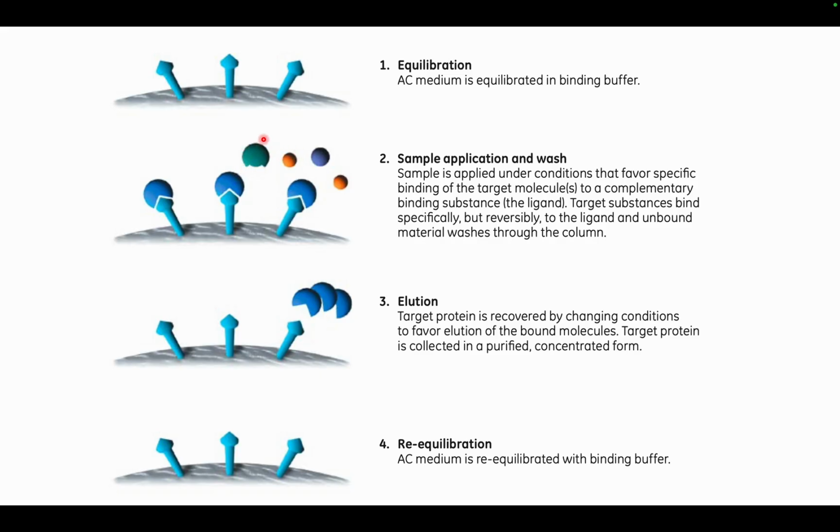In case any of these other proteins are able to bind in some non-specific manner to the column, we want to remove those first. Now, obviously, because they're binding in a non-specific way, the strength of that interaction will be less than the strength of our regular affinity interaction, right? Because this is a very specific binding. And if this is just getting adsorbed onto the matrix, maybe that's not a specific interaction. So that can be eluted by washing the column with our buffer, right?